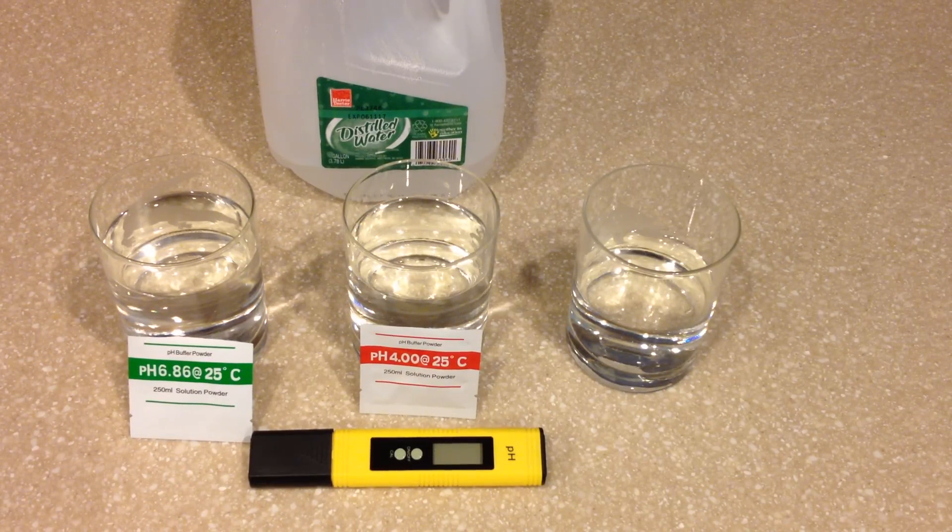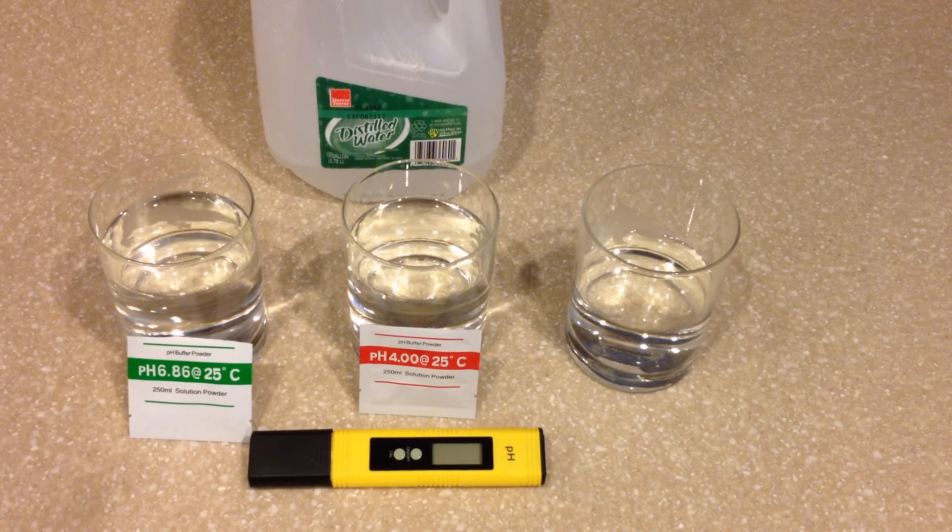In this digital pH meter review, we're going to be talking about the RyzenTech digital pH meter because I believe it has a function that is different than the other meters out there. It's the reason I like it the best, and it's the automatic calibration function, or the push button calibration function if you will.